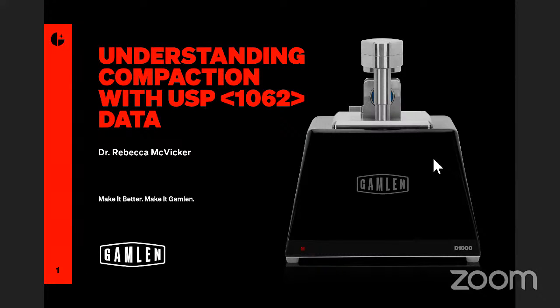I'm Rebecca McVicker. I'm the Product Director at GAMLEN, and I will be talking today about using USP 1062 data to better understand compaction. The United States Pharmacopoeia published chapter 1062 a couple of years ago. It's on tablet compression characterization. And essentially, it tells you how to analyze compaction.